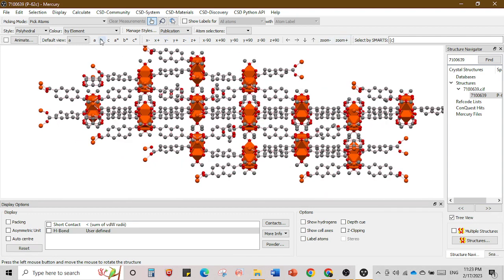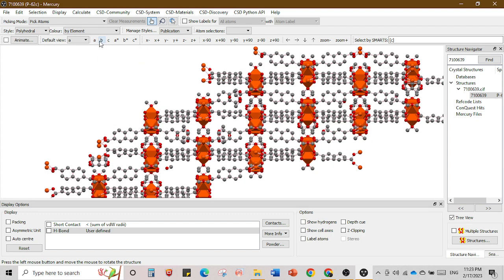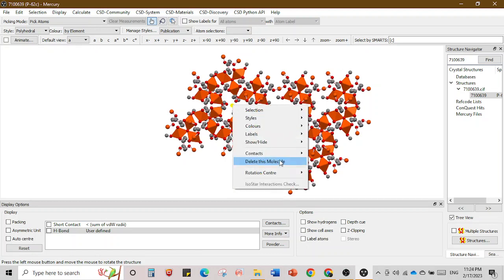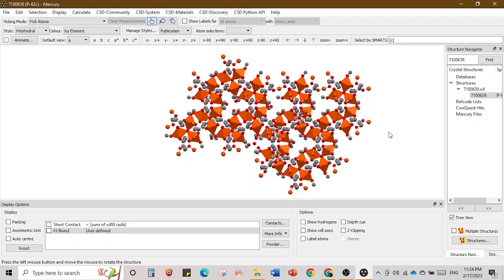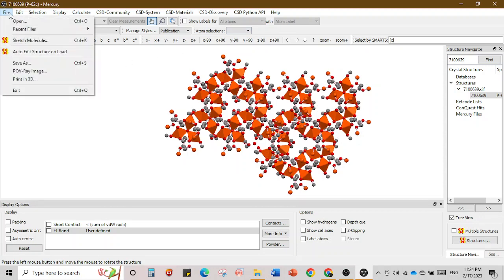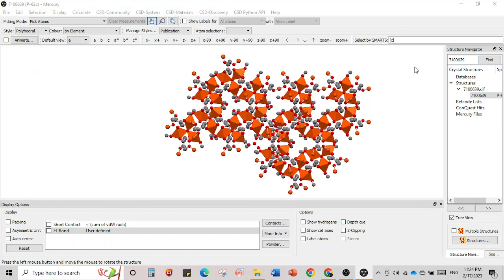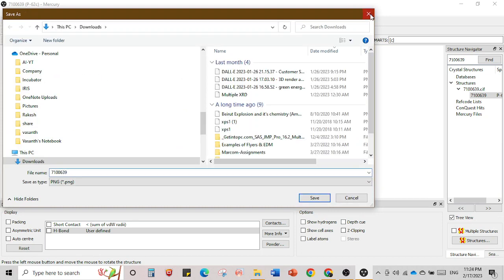Along c the pores are visible. You can hide atoms to clean around the structure and get a good picture. When you are finished, go to 'Save As' and save in the appropriate format — you can save as JPG or PNG or other formats.